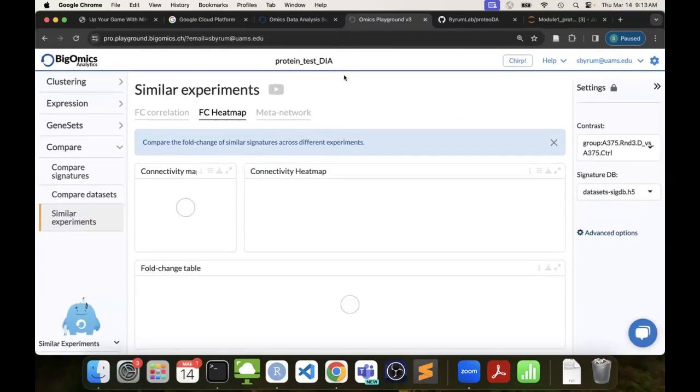Anything else on this one? Stephanie, what do you have to use as the identifier? UniProt, they've added UniProt IDs. Okay. And the other thing is the organism. That's always a popular question. So they have over 200 species that are currently in there. They are working on the bacterial side. That's not quite there yet, but they're adding to the organism list too.